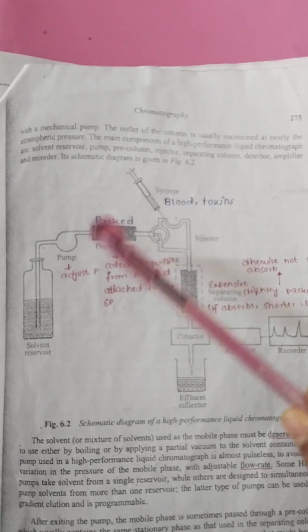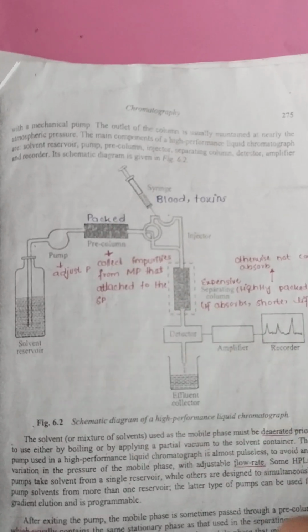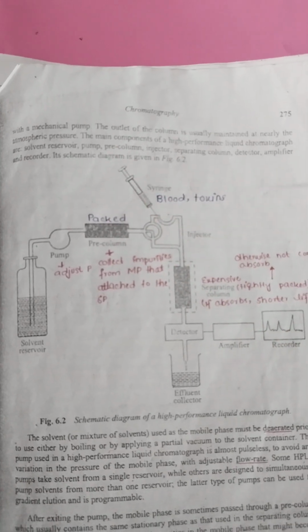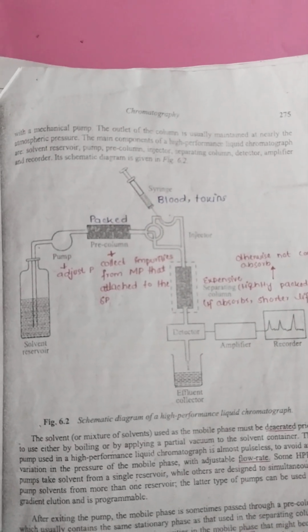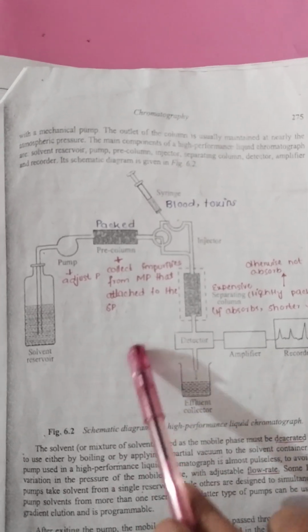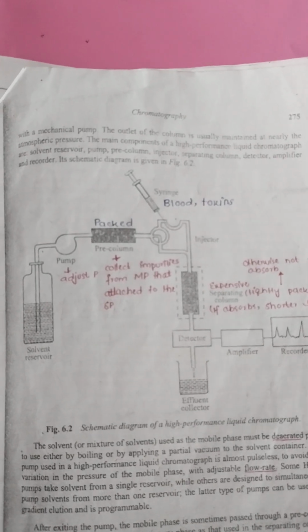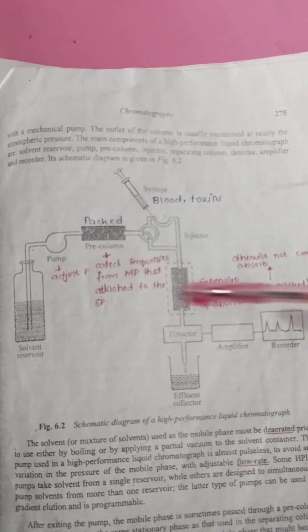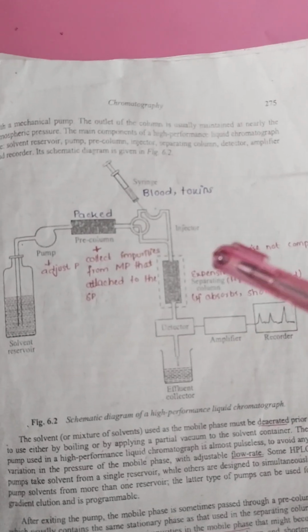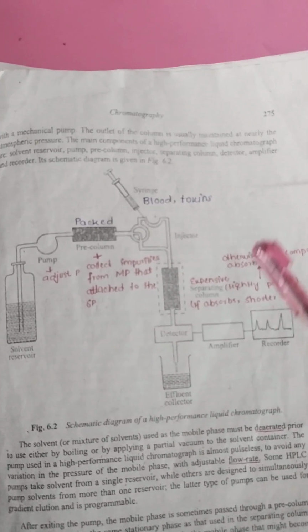What does the pump do? The pump adjusts the pressure and controls the flow rate, because our stationary phase is packed, which impairs the flow of the mobile phase. That's why we use a pump that increases the pressure of this flow, and it passes through the pre-column. There are two columns we use. First is the pre-column and the other is the separating column. The pre-column collects impurities from the mobile phase that would attach to the stationary phase.